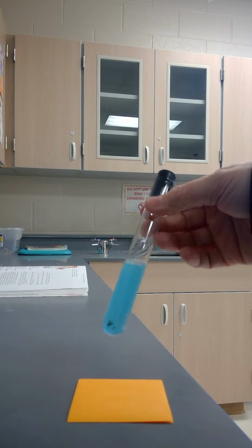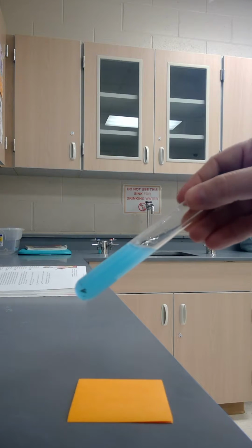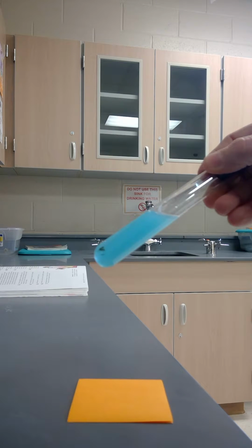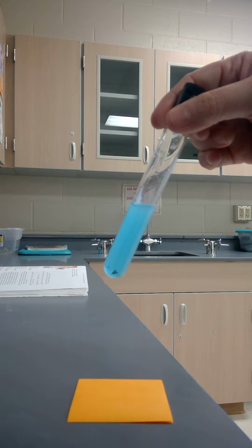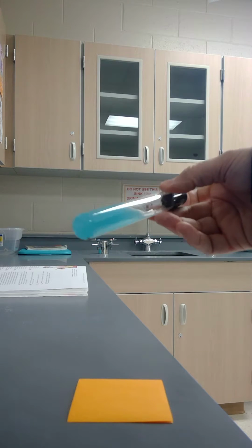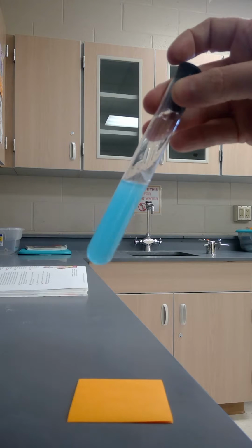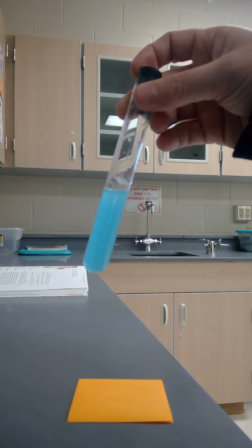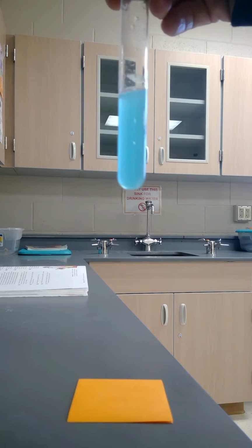All right. So I've mixed, and there's what I see. Which is the solute? Which is the solvent? And do I have a solution? Go ahead and document all of your observational properties. Color, right? What does it look like? How well did it mix together? Do you see any sediment pooling at the bottom? I don't think so.